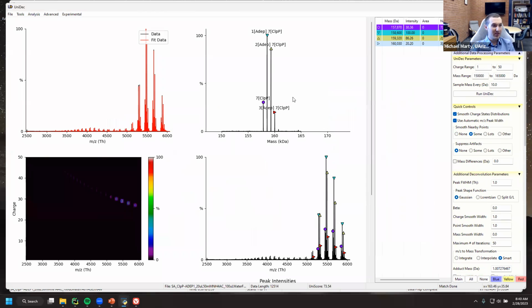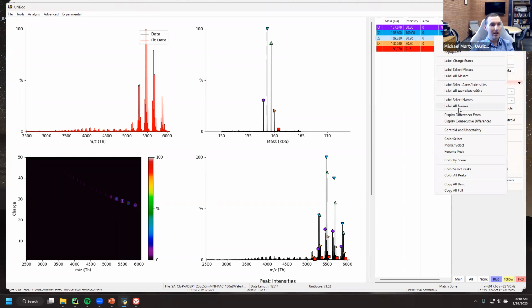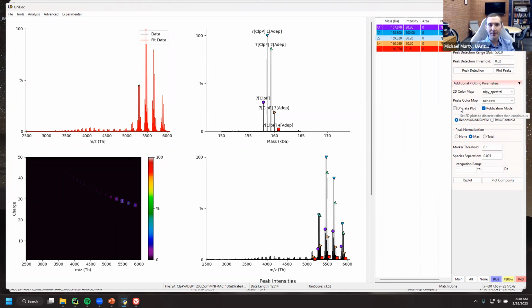And there's even the fourth bound here, which you would maybe struggle to see confidently if you didn't have the DoubleDec in here. And we get that if we now lower our threshold to like 0.01, I think we would get it. Raise it. See if I can clip that. There we go. Control M will now match them. And now we can label them and see all the things.